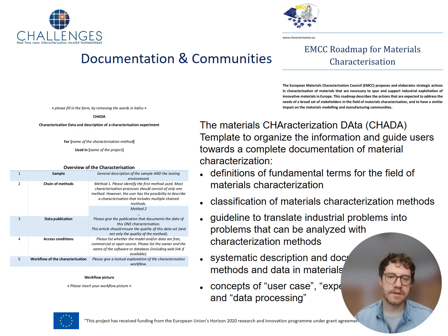How CHADA works is it gives the applicant of a certain characterization technique a sheet of guidelines. These guidelines are then classified according to different categories. For example, how the data is published, how it can be accessed, how the characterization was applied, so what was the workflow, and also descriptions of the sample.